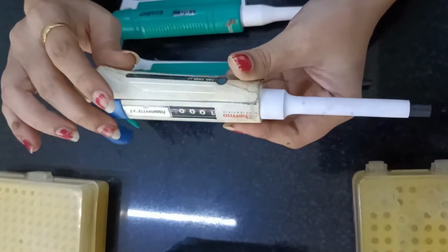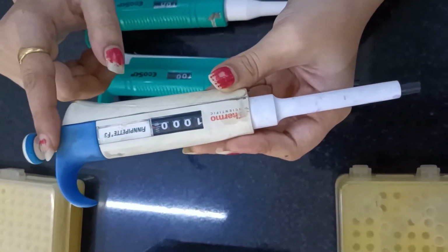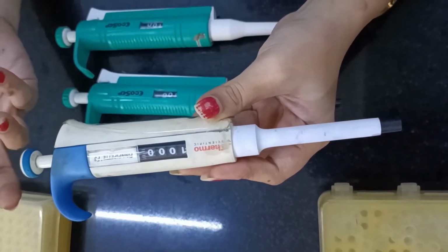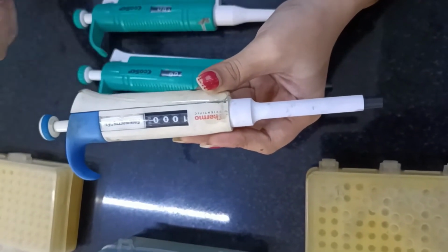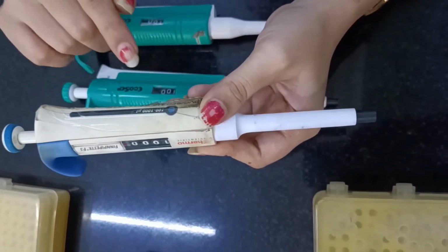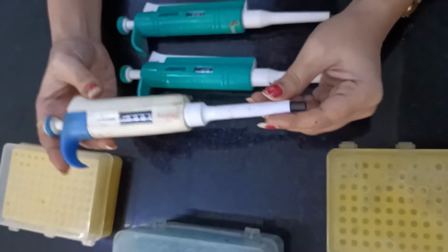not being used, it has always been placed at the higher volume over here, so that pressure is not applied onto the spring which is held over here, which might cause damage to this micropipette and create an error while you selectively take out a particular volume, as the damage has been created with respect to the micropipette. So always remember, whenever you are done with the work, keep the micropipette at the higher volume with respect to that particular micropipette.